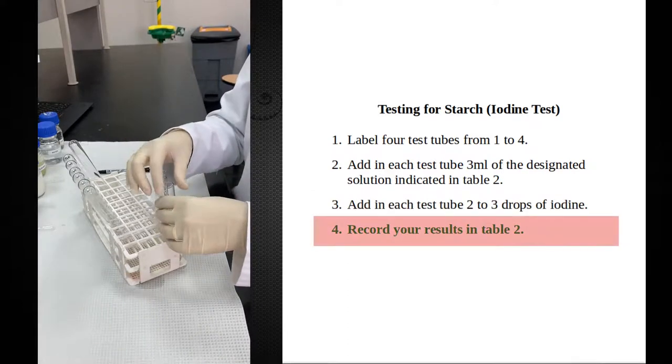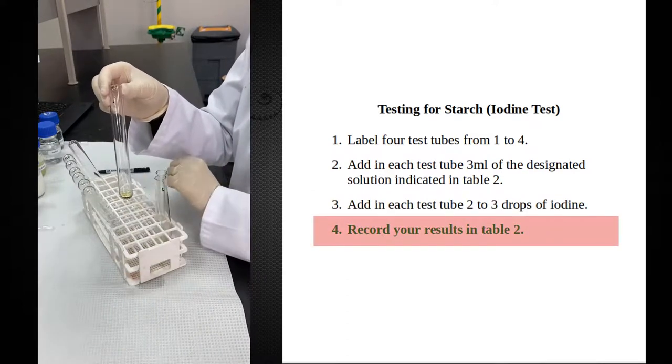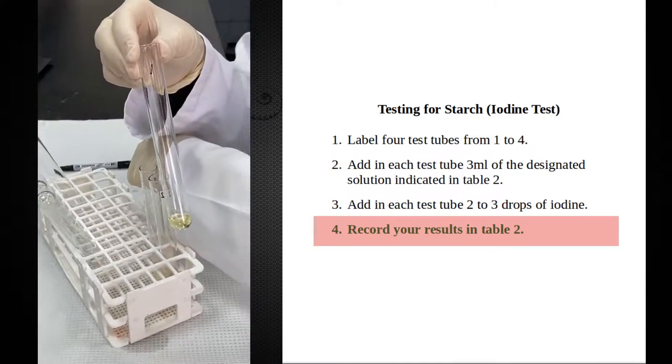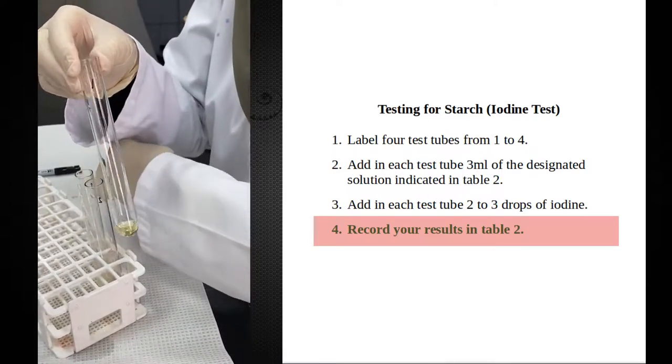Okay, results are clear. This is the result of my negative control. This is the yellow color, original color of iodine. This is negative result.